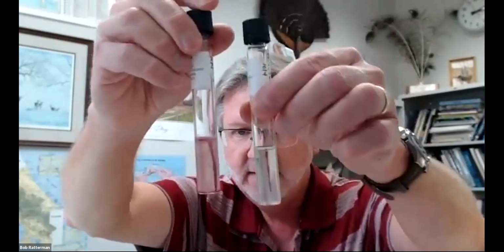Contrast that with the Proteus vulgaris, which is certainly growth at the stab line, but you can see how the other part of the tube is pink all throughout, meaning that there are bacteria that moved from the stab line out into the entire motility media. So this is motile, this is non-motile.